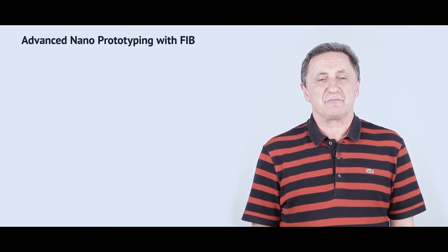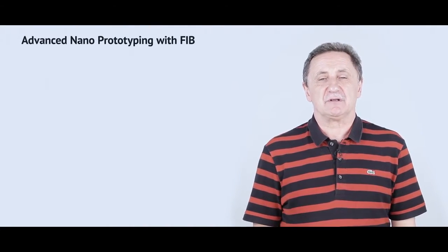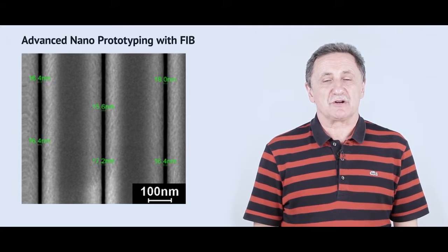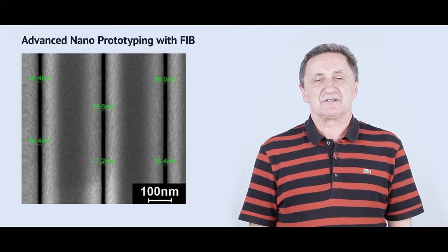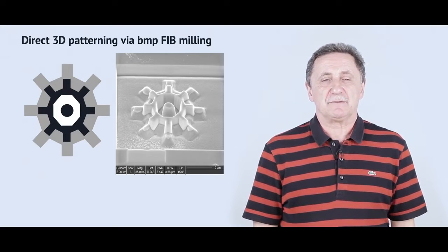Just a bit more information: with the help of the same ion beam, you can make whatever you want on the surface of your sample. For example, you can make different types of channels with a thickness up to 10 nanometers, or much more complicated structures, which you can see on the right of this screen. Moreover, you can even build 3D articles on the surface of the sample.